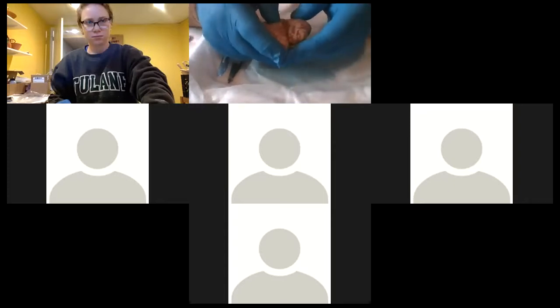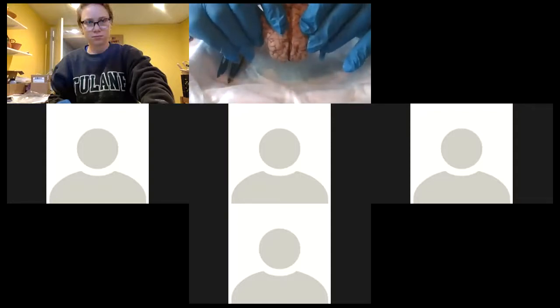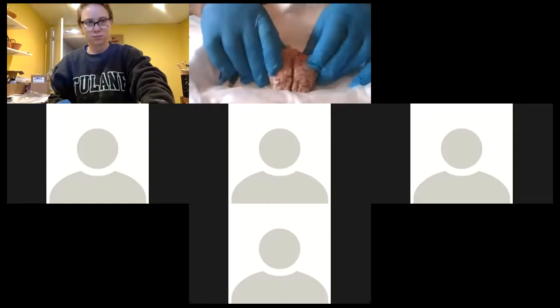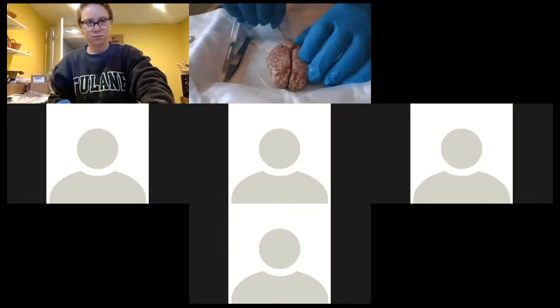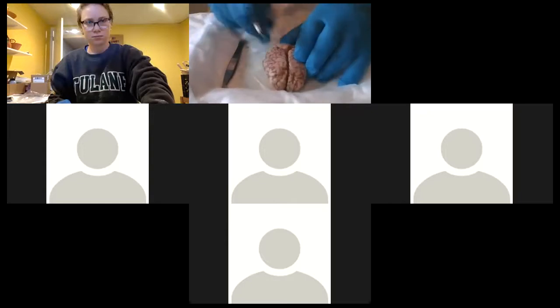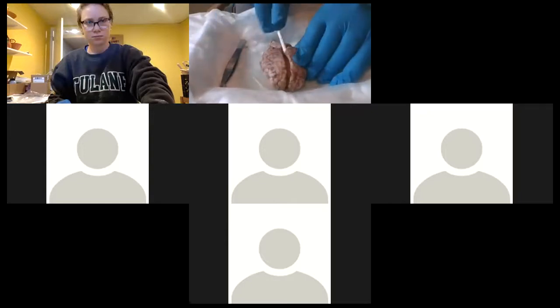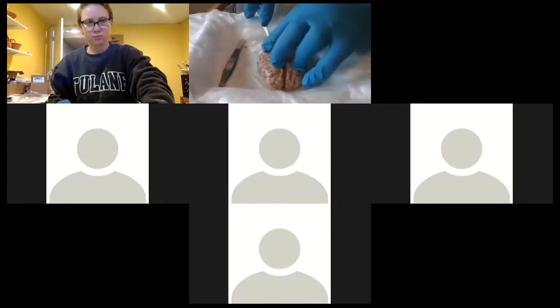So take a look at all that and feel it with your hands and see if you can see the corpus callosum down the middle there. And now you're going to make a cut straight as you can. Sometimes it helps to put a toothpick or something to hold it in there. This bottom piece is styrofoam. So you want to cut as straight down the middle as you can. Gently cut the corpus callosum through the cerebellum and cut down the center of the midbrain. And then almost all the way, all the way to the spinal cord.